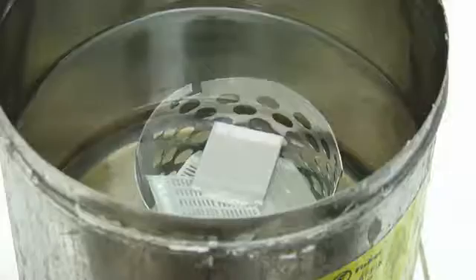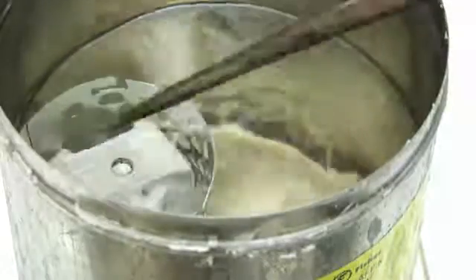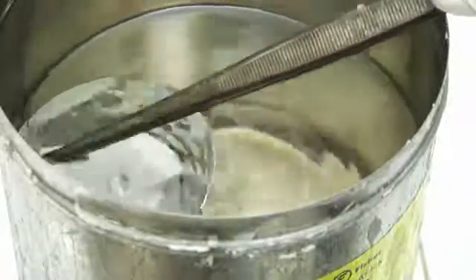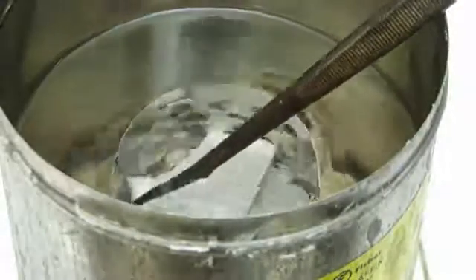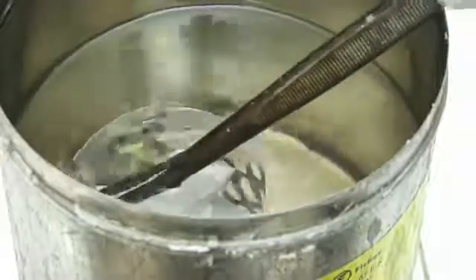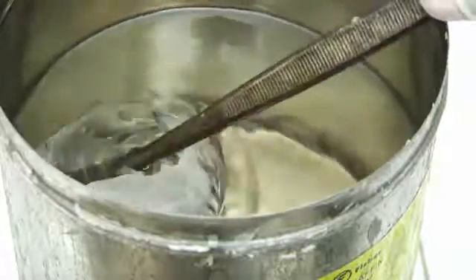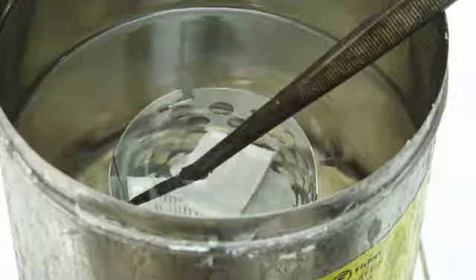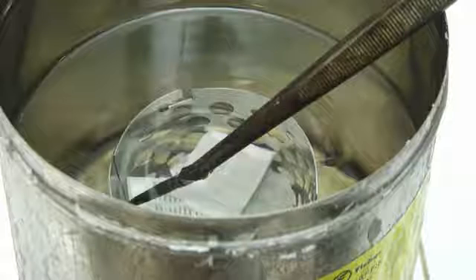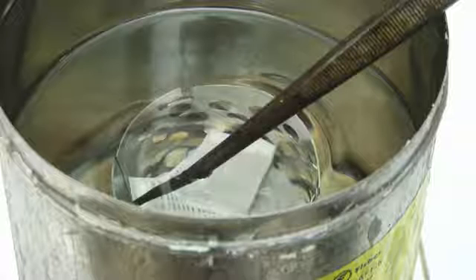Now, the water is driven out, but alcohol and wax are still immiscible. So, we need a reagent that can mix both alcohol and wax and can act as a bridge between the two. This reagent is the organic solvent xylene. So, we immerse the tissue in xylene and drive out the alcohol. This step is called clearing. Multiple changes may be required to clear the ethanol.